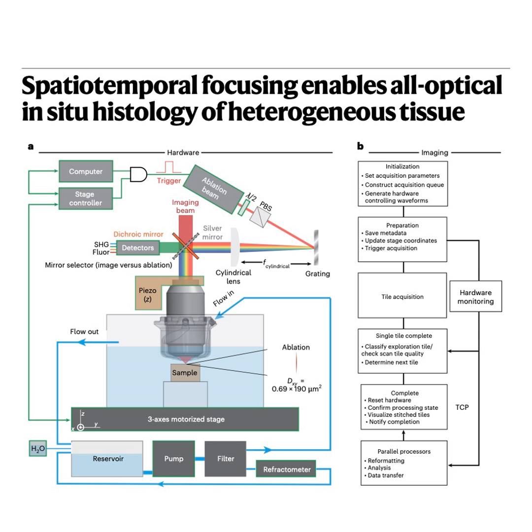Okay, let's recap quickly. We have this system that uses multiphoton microscopy to see different tissues. It uses spatiotemporal focusing to create a line-shaped laser pulse for fast, efficient cutting via plasma ablation. It beats the bubble trouble with the flow system. And it maintains perfect focus over days using a camera watching a refractometer to control the fluid's refractive index. That's the hardware and the basic physics sorted. Pretty much, yeah. A very sophisticated setup.